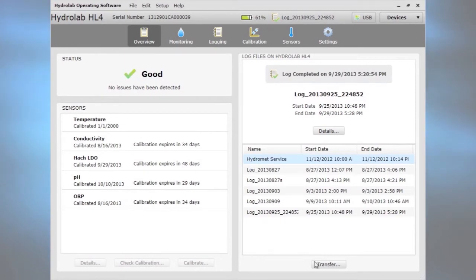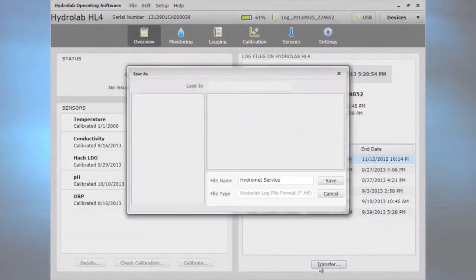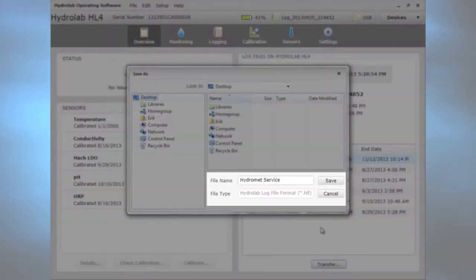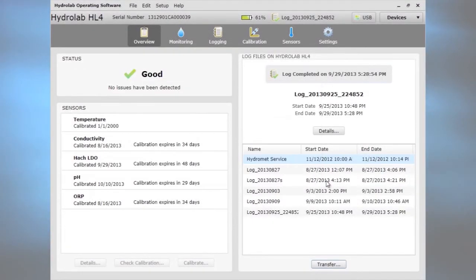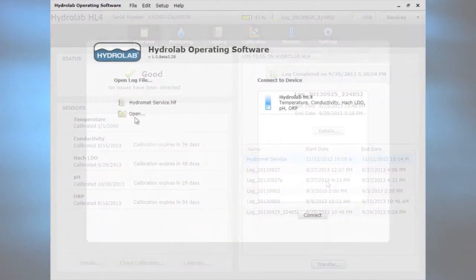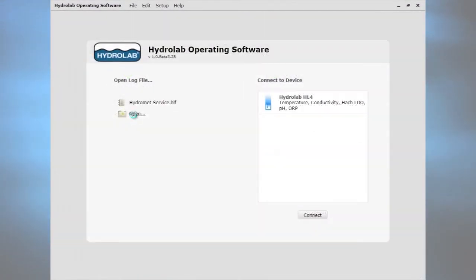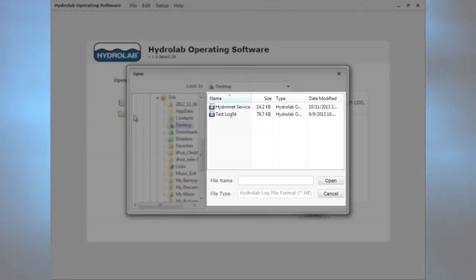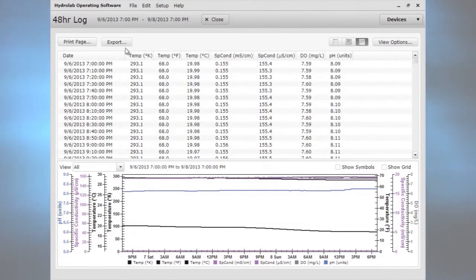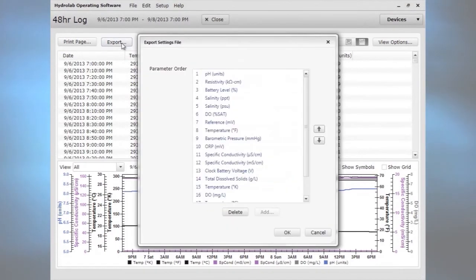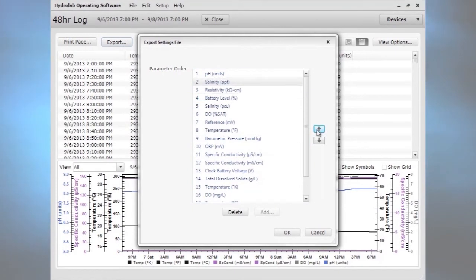Transfer a log to a local drive. Open a log file from a local drive. Export a log file in CSV format to a local drive. Choose the parameter order or delete unwanted parameters.